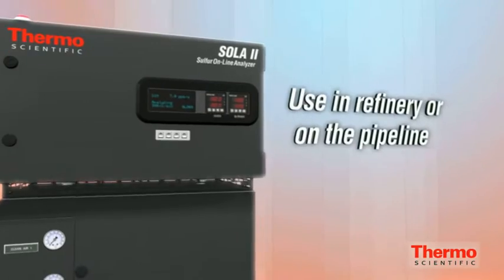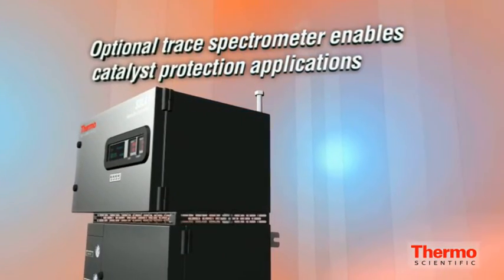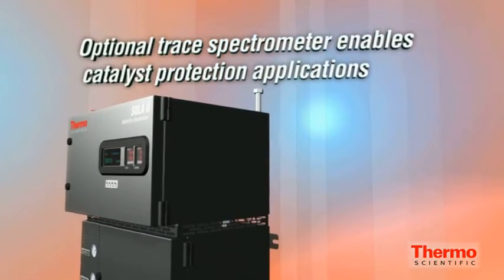Isomerization and reforming catalyst protection applications are enabled with the SOLA-2 trace, with detection limits as low as 25 parts per billion.